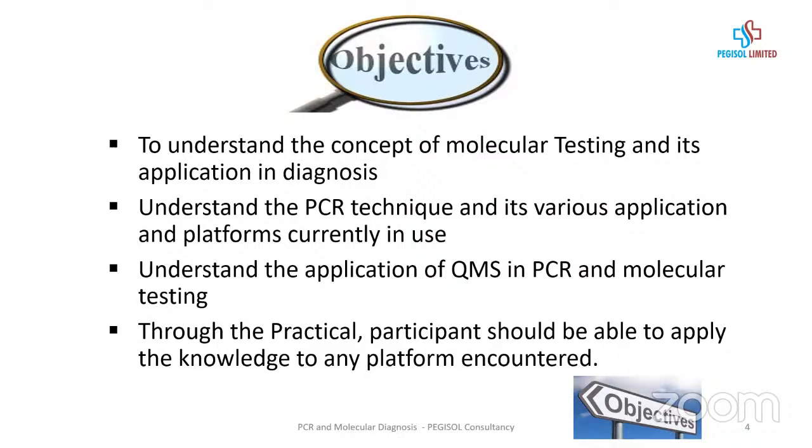So through the practicals, which some of you that are in Lagos are going to come to the lab for, you should acquire the practical skill to know how to work on the bench, to do DNA extraction, PCR techniques, basic DNA electrophoresis, and to have an idea of the basic concept of molecular diagnosis. Then you can apply it on a larger scale based on where you are working.